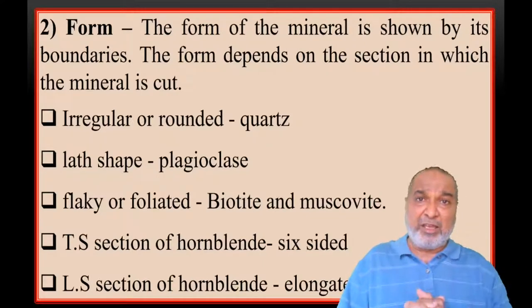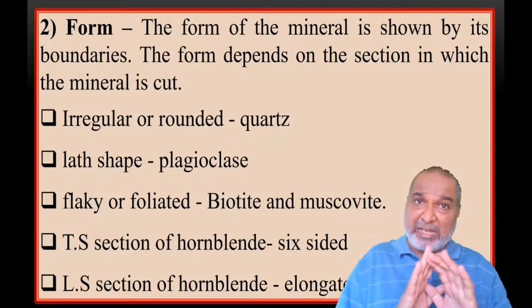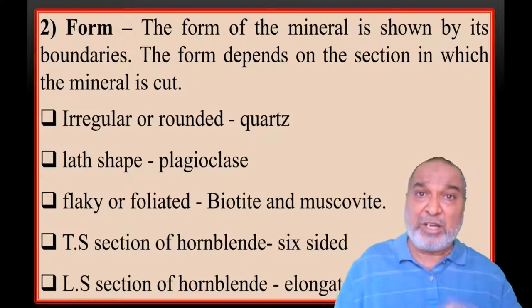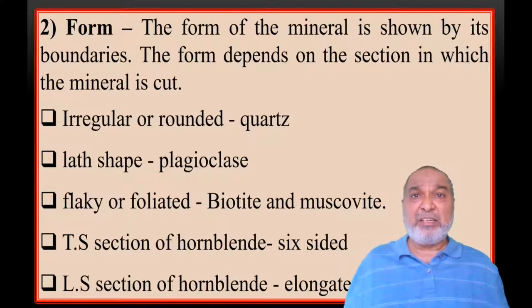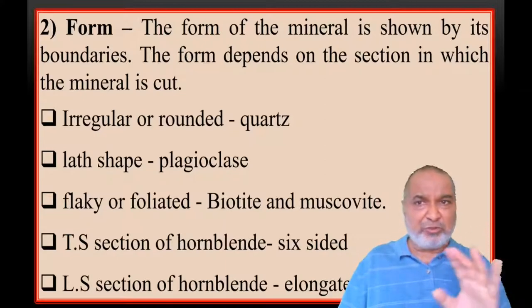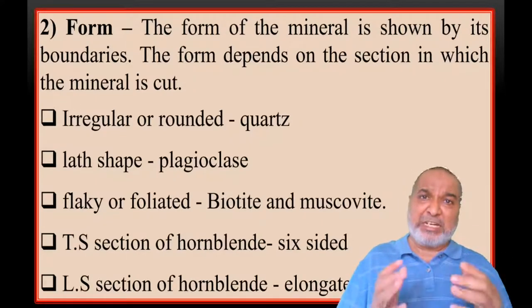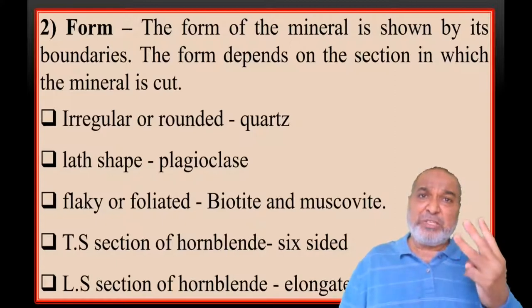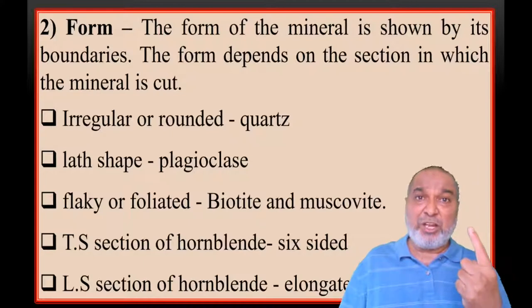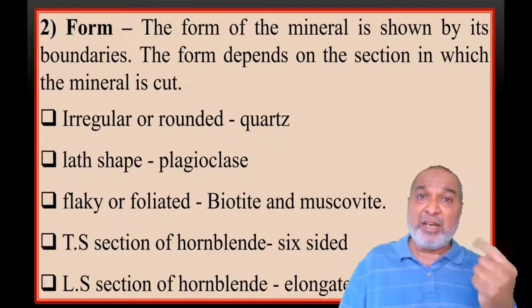So these are the three. And the fourth one is amorphous. The mineral is not crystallized in this category, but only natural glass is there. So that is the fourth type, the amorphous one. So crystallized, crystalline, cryptocrystalline, only you have to see similar ones under the microscope. When you study the thin section, we are going to see three main types of forms. In that, the first one is euhedral crystal, subhedral crystal, and anhedral crystal.